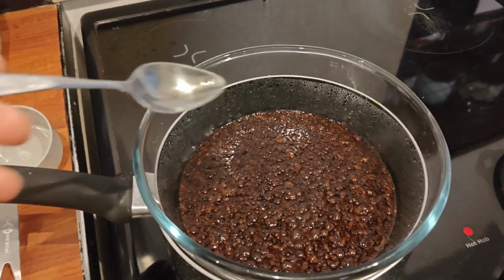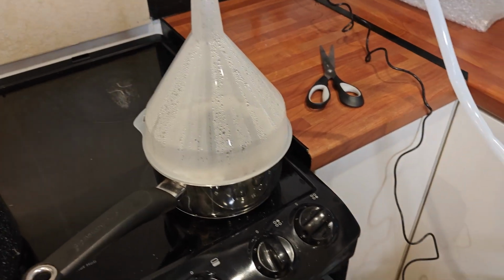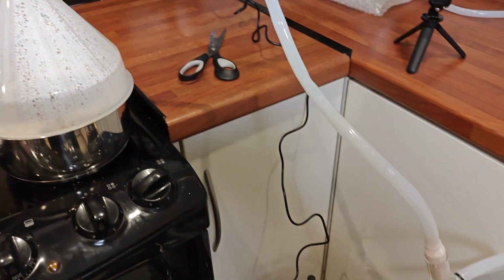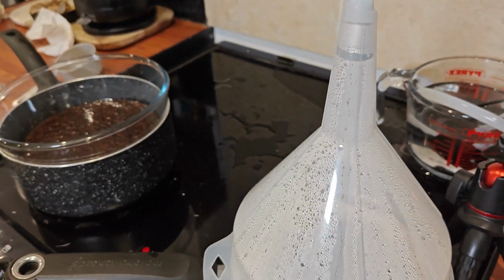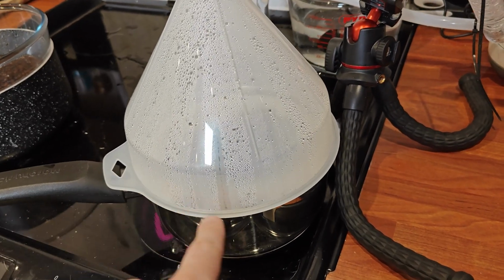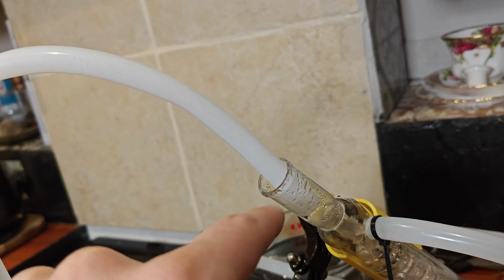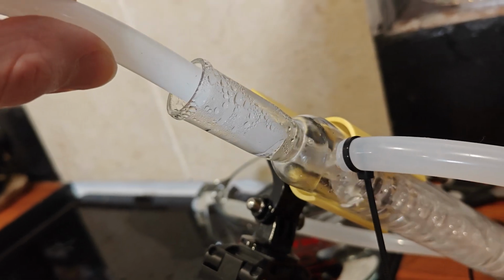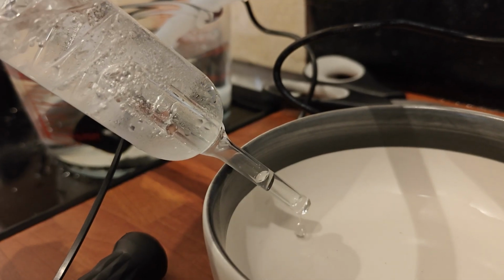At this point, the oil infusion was doing well, it was ticking over nicely, but the steam distillation wasn't so much, and I tried moving things around to fix it, but the main problem I was having at this point was steam escaping. Now, it's not like a sealed system, it's just an upside down funnel, and along multiple points along the way, the steam was getting out, and therefore I wasn't getting very much condensation. So I'll try and fix these problems a little bit later in the video.